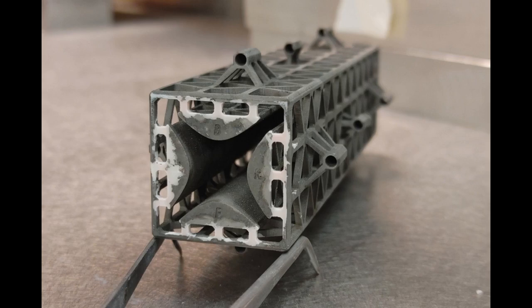But miniaturizing a quadrupole is no easy task. Making the filter smaller usually introduces errors during the manufacturing process. Plus, smaller filters collect fewer ions, which makes chemical analysis less sensitive. The MIT team balanced this trade-off by leveraging additive manufacturing to make miniaturized quadrupoles with the ideal size and shape to maximize precision and sensitivity.